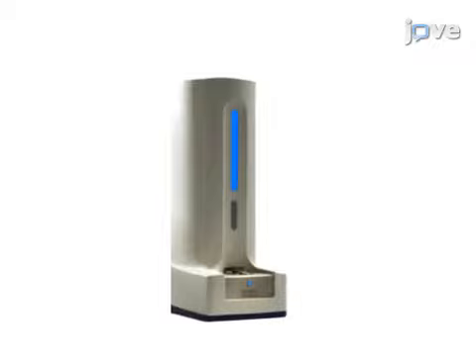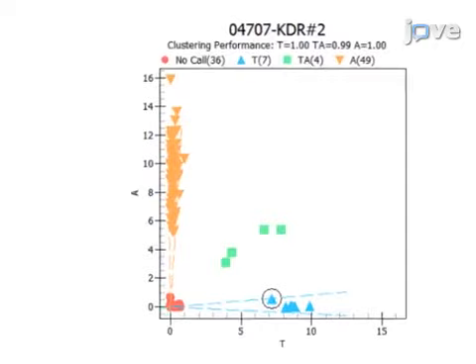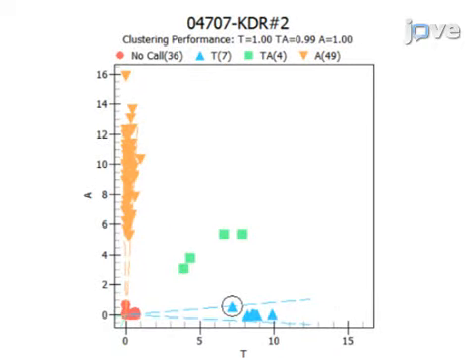Then, measure the mass of the allele-specific amplimers using a mass spectrometer. Ultimately, calculation of the magnitude of each allele signal from the results can detect the presence of the allele for a corresponding SNP.